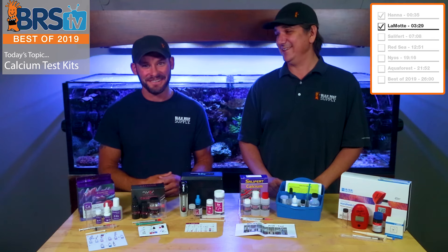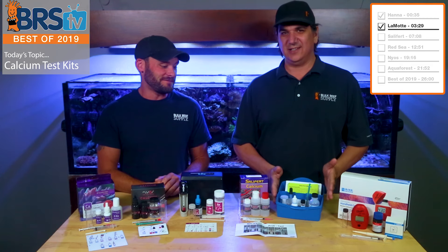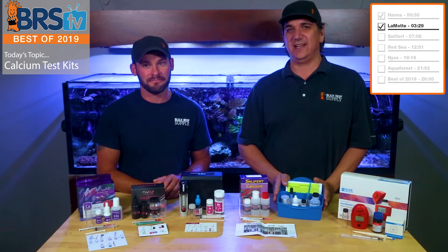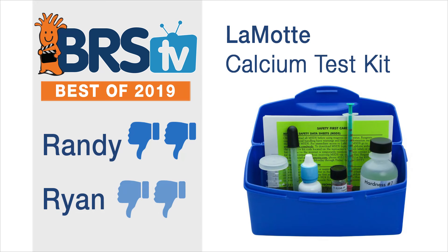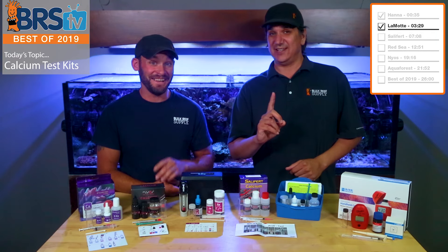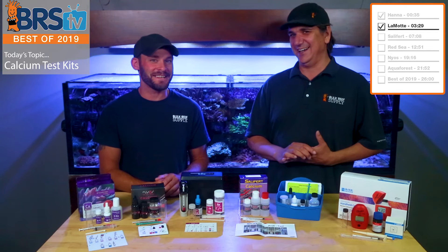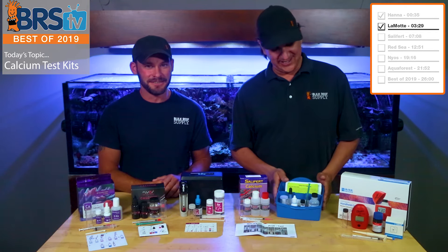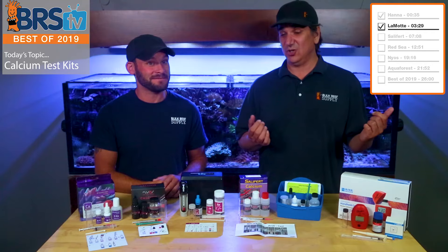That kind of tells the thumbs story — two thumbs down. This kit made it into the mix because we all liked the Lamont alkalinity one a lot and thought, why not bring in the calcium one? But after testing it, it just doesn't meet our standards. It's not a good test kit for a saltwater aquarium owner. There's one left being clearanced from the website — get a piece of history, but don't actually use it. Interestingly, the two most expensive options here are probably not the ones we'd use.